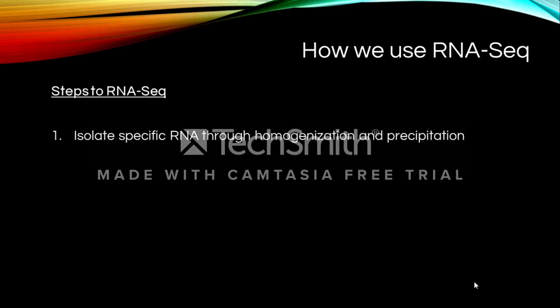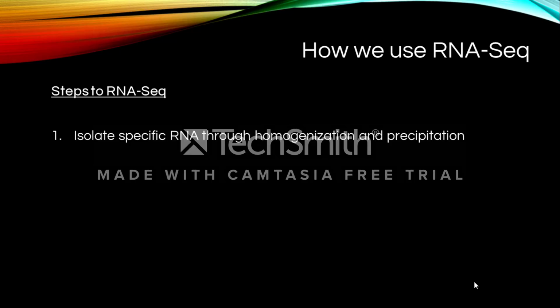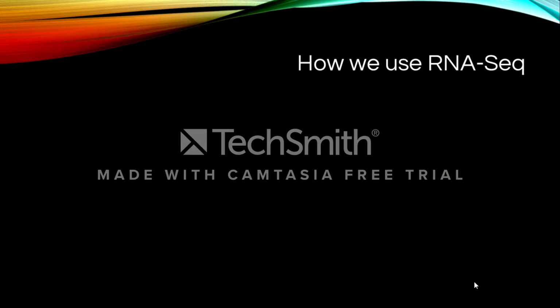First, you must isolate your RNA. RNA isolation for RNA-Seq is no different than the RNA isolation protocol that we perform in class. First, you must homogenize or mix your tissues. You can do this by using Bead Bug homogenizers shown on the left or the Dounce homogenizers shown on the right. Next, you must pipette out the top layer in the tube without getting the middle layer, which houses the DNA. This top layer is what houses your messenger RNA.